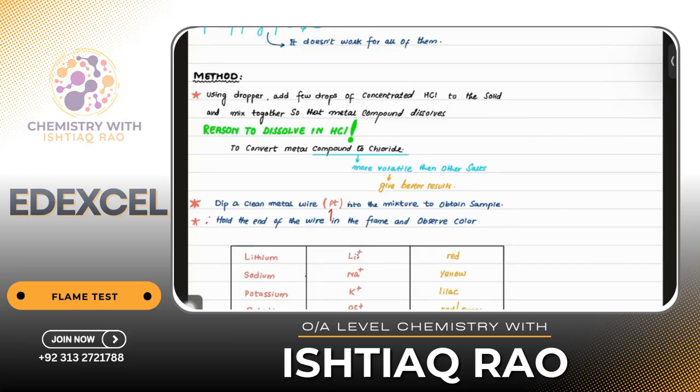This is the reason why we are dissolving in HCl: to convert the metal compound to chloride. And chloride is more volatile than other salts. Volatile means it can evaporate easily, so it will burn easily. As an example, what if I'm using a fuel having more carbon atoms? What would happen? It would not burn.